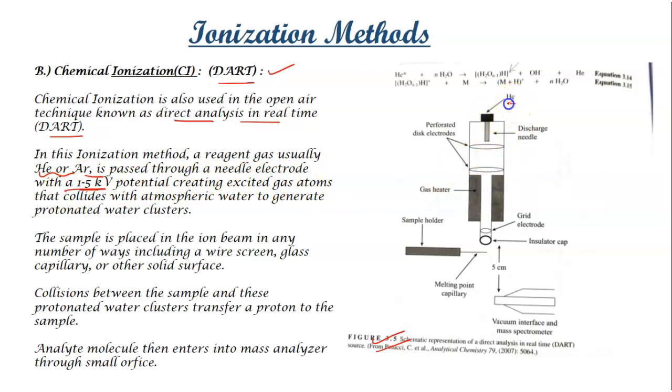The gas passes from this needle and creates excited gas atoms that collide with atmospheric water. Here it is colliding with the water molecule to generate a protonated water cluster, which you can see in this reaction.